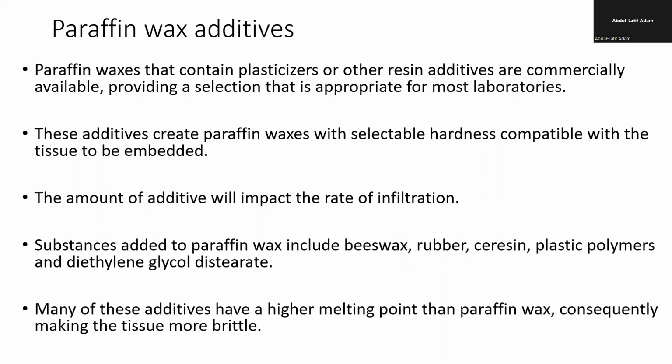So sometimes you add some materials to the paraffin wax, because sometimes the tissue is so hard that the paraffin wax cannot hold it very well. Or sometimes the paraffin wax is so hard that it cannot hold the tissue very well. So when the paraffin wax is soft, you want to add hardness, something that can help harden the wax so that it can hold the tissue.